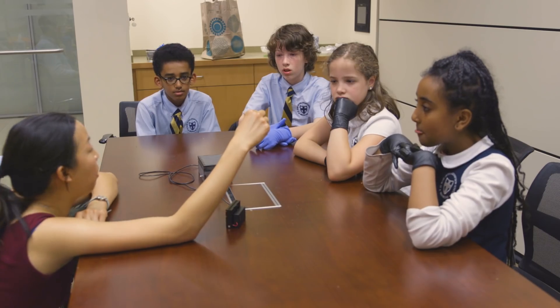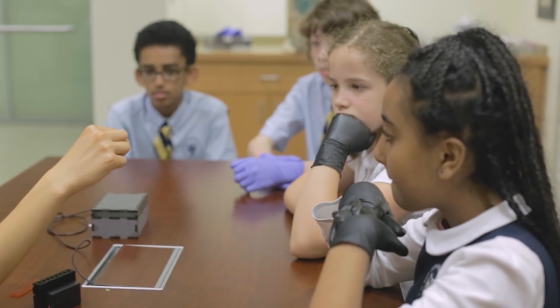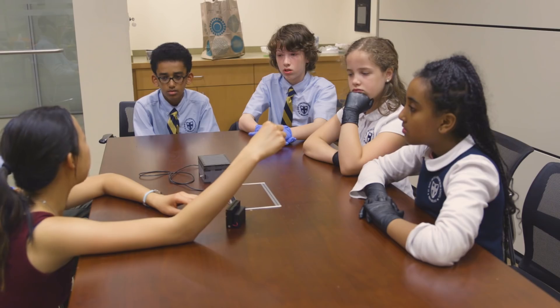Usually what I do in the lab is I grow a bunch of E. coli and give the E. coli DNA, and the E. coli cells take the DNA and give me my protein back. But we don't want to bring live bacteria like E. coli into classrooms.